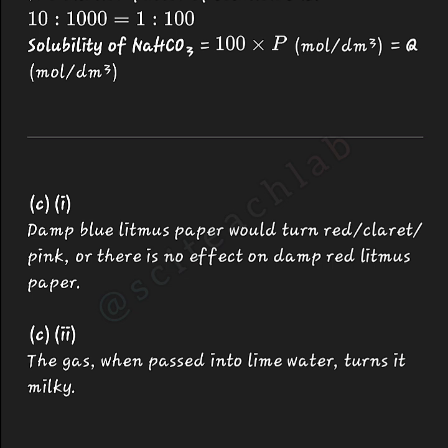You bring a damp litmus paper. How you damp it is just bring a litmus paper and then sprinkle a little water on it. Don't go and wet it so that you cut. Just sprinkle a little water on it to make it moist. Okay, and then use it over the gas. As the gas is coming, let it touch it. You will see that the blue litmus paper will turn to red or pink if you want.